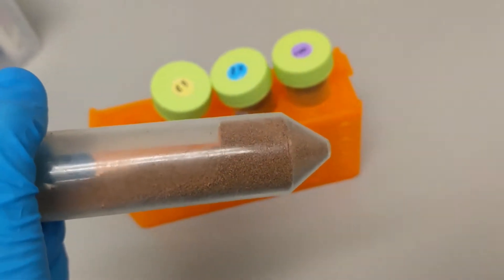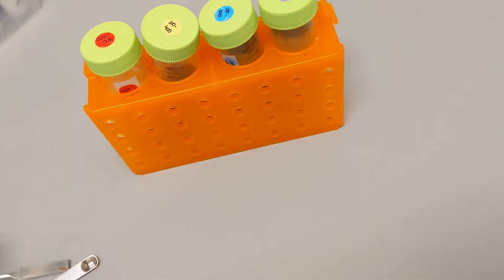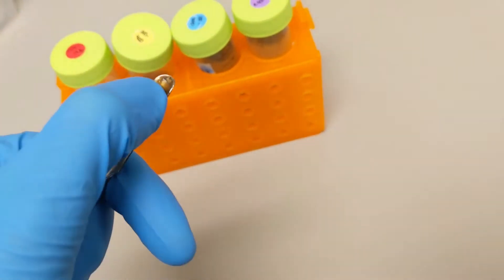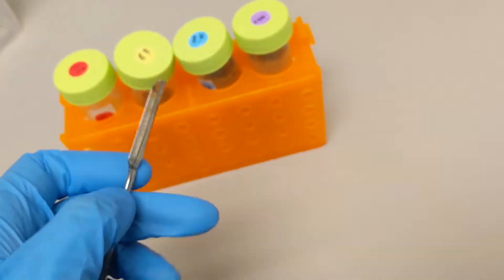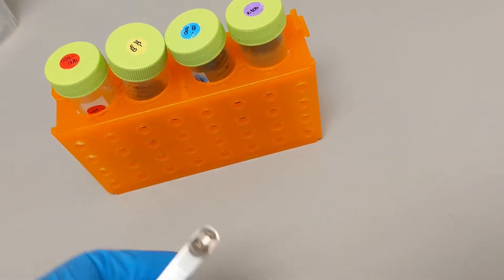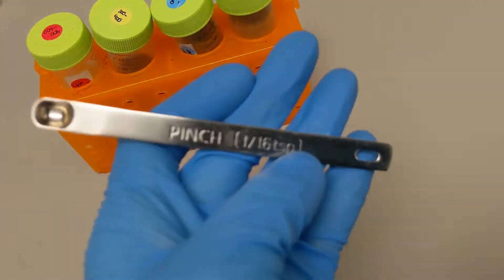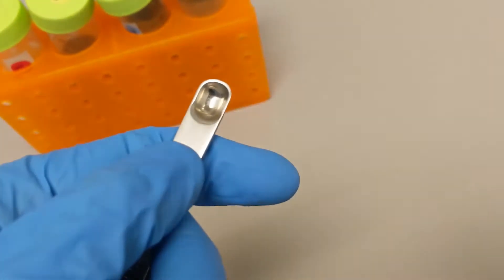Our baby fish get fed three times a day with the smallest food, about the amount that's at the tip of the spatula. Our adult fish get fed twice a day — once in the morning and once in the evening — with a 1/16 teaspoon scoop.